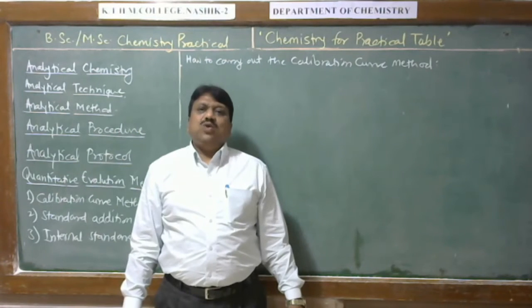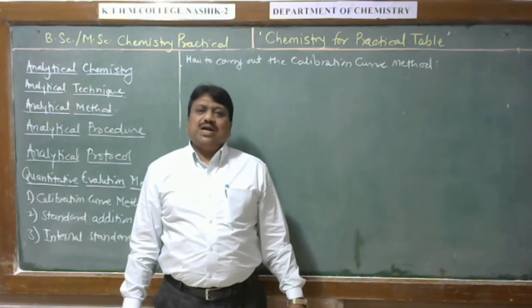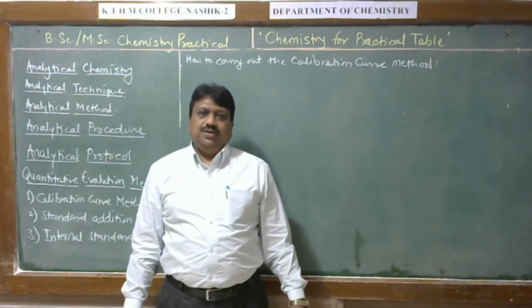And now we discuss how to carry out the calibration curve method in the laboratory, how to perform the analysis by calibration curve method.